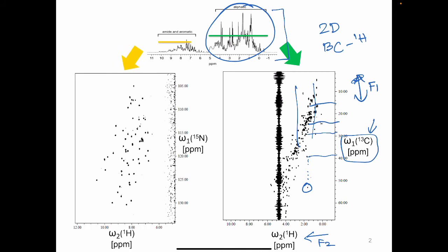Similar is the case when you go downfield. In this case, we see a 13C1H spectrum, but at the same time, you can also get a 15N1H heteronuclear correlation spectrum that helps you resolve the amide resonances that are present. For audience who might not be comfortable with amino acids, basically you're looking at a backbone of a polymer that looks like this.